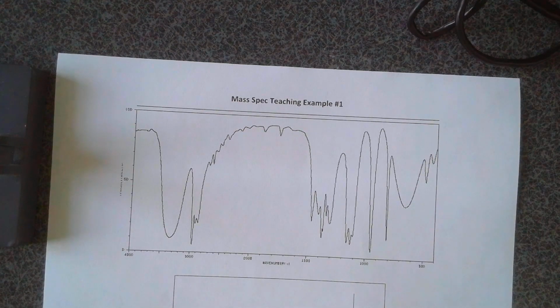All right, let's go. I know I've been talking for quite a while, so I'll try to make this short and sweet and just jump into the mass spec. But before we do that, you obviously need to look at the other spectra to get an idea of what's there. So first thing we always look at is the IR spectra.